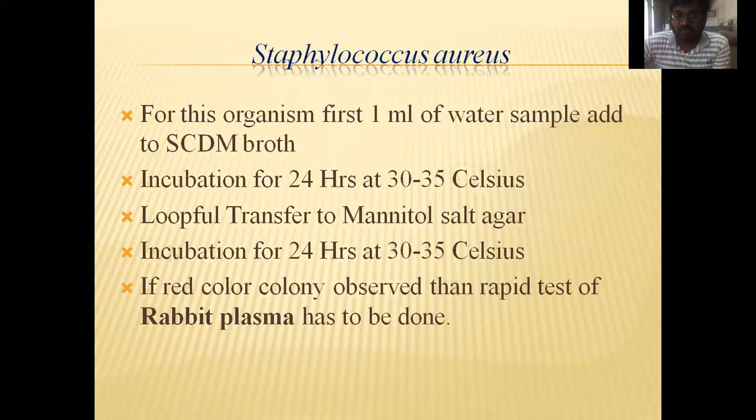Many pharma companies do a rapid test for Staphylococcus aureus because Staphylococcus is a very dominant and potent organism that is present in the water. So a rapid test is performed for Staphylococcus.